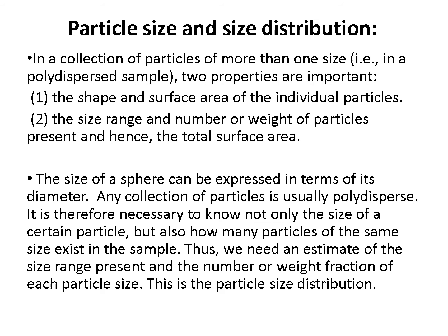It's one part of the micromeritic preformulation study, just to know what the particles available in our sample are and what the percentage of their distribution is. يعني أنا لو بدي أدخل particles لصناعة دوائية in tablet, capsule, suspension, first of all I need to know what the particle size of my sample is, because particle size will influence different things: the dissolution, bioavailability, during manufacturing.